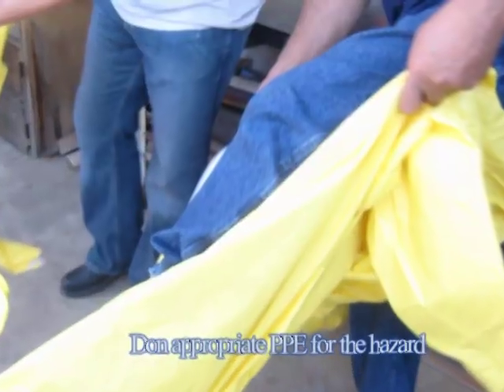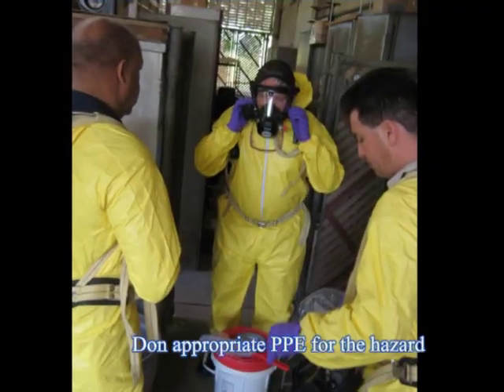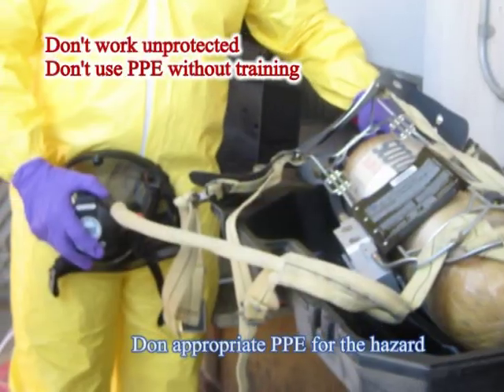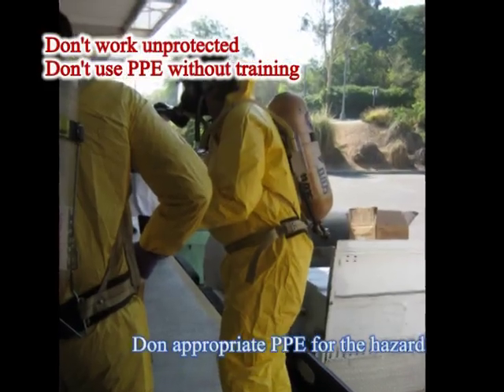When you're ready, don personal protective equipment as appropriate to the hazards. Consider the need for respiratory protection, the use of which requires specialized training and medical surveillance. Never enter a contaminated atmosphere without protection or use a respirator without training.